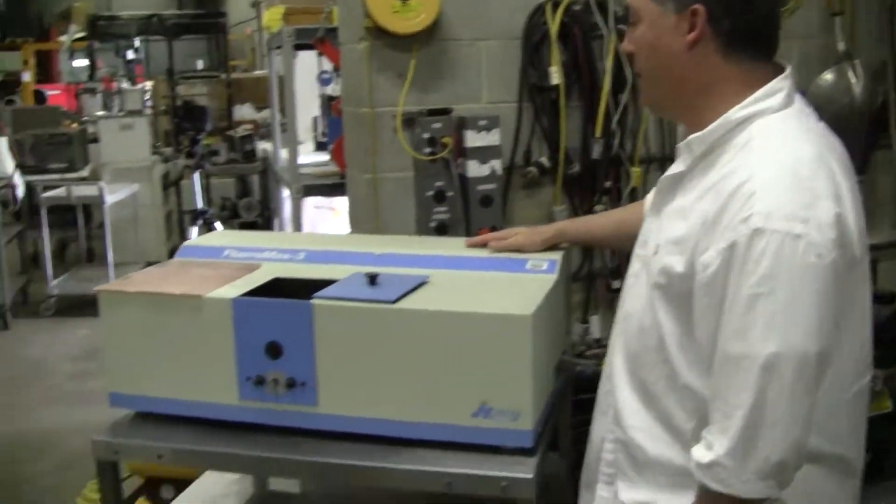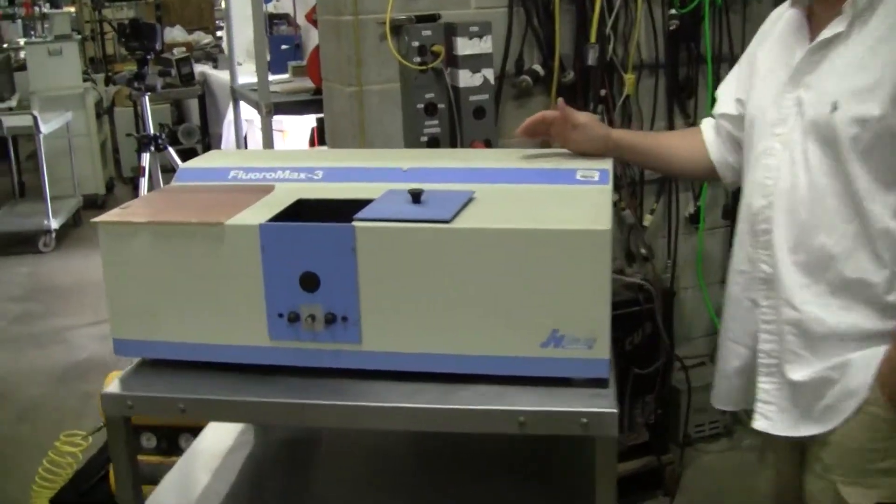Hi, this is Michael Naitow from HitechTrader. Today we're looking at a Floromax 3 luminescent spectrophotometer.